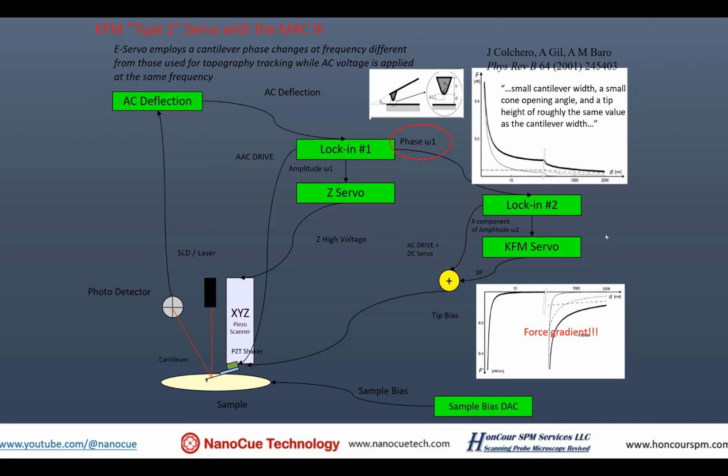I don't think your Agilent AFM has the three lock-in amplifiers in your instrument, but those are a lot of fun to do, because once you have three lock-in amplifiers, you can do far more experiments way beyond these advanced imaging modes, including a lot of advanced applications you can invent yourself.